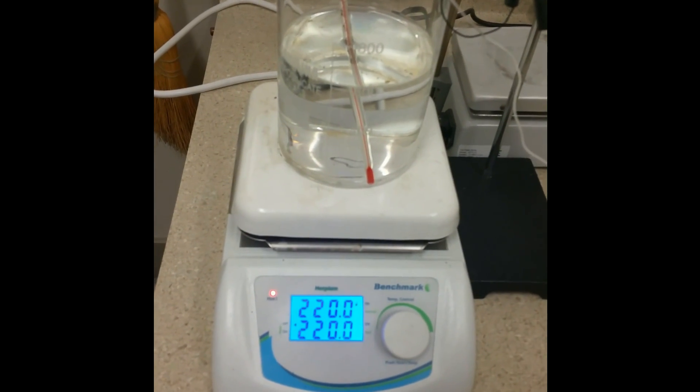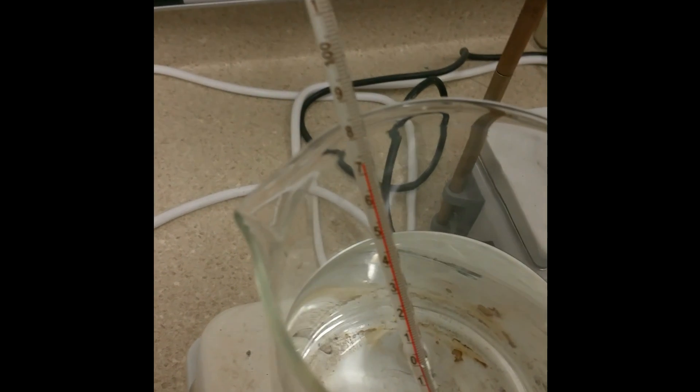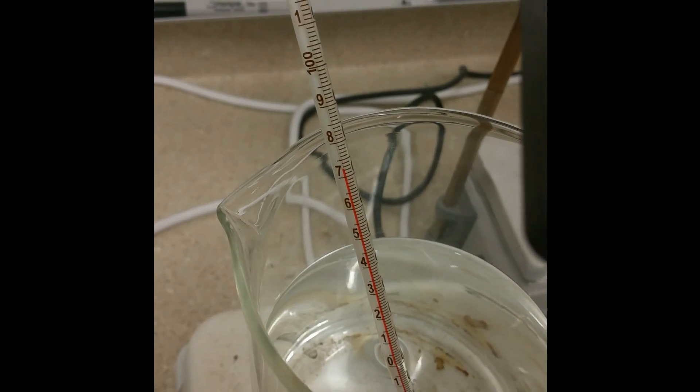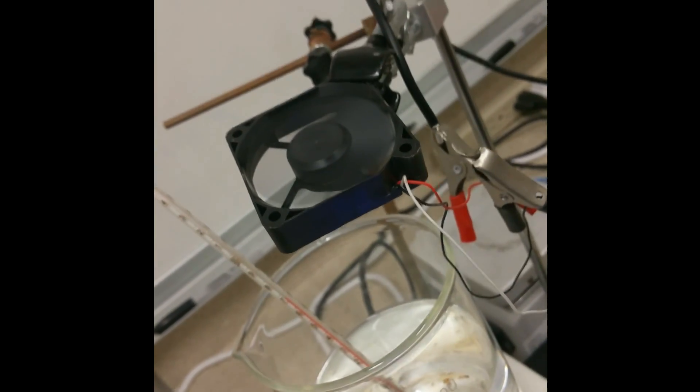What really works, and the only thing I found to work, is evaporation of the solvent, which is water. Here's how I do it: take your liter of the solution in the bottle, heat up the hot plate to 220 degrees Celsius. What's more important — and easier to control — is the temperature of the actual solution. I have it up at about 73°C. Anywhere between 60 and 90°C is pretty good.